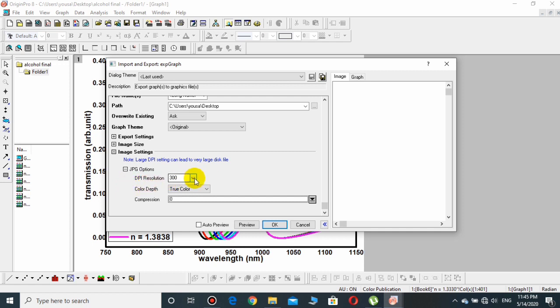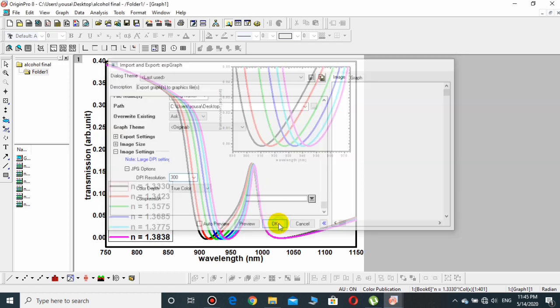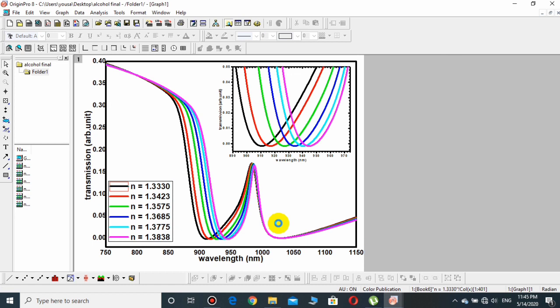Here it is 300 DPI, but if you want to choose any one of them you may choose as well. But I'll prefer 300 because it's okay. Click over OK. After one or two seconds this will be saved.